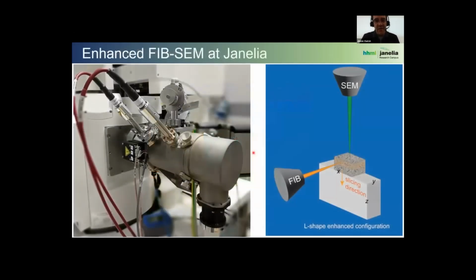The picture on the left here is the AIC's FIB-SEM system that we have. You could call it a hybrid commercial and bespoke system. It works off of a commercial SEM system, but we've engineered some things into it very specifically, including part of the FIB, that increases the stability over what some other commercial systems can achieve.